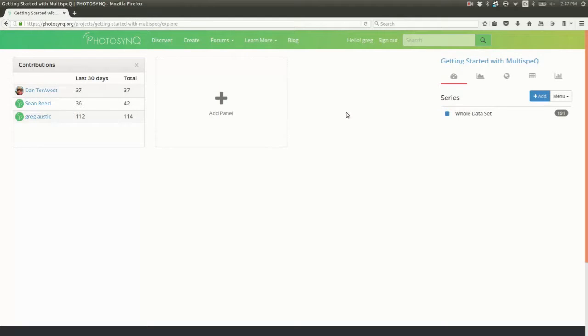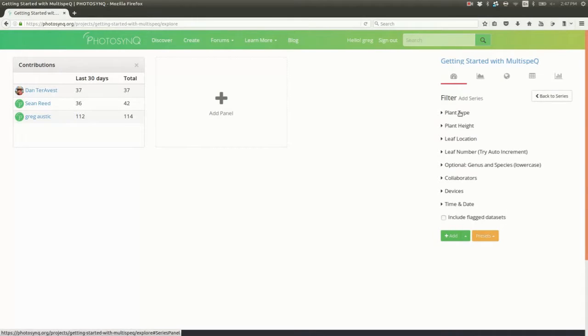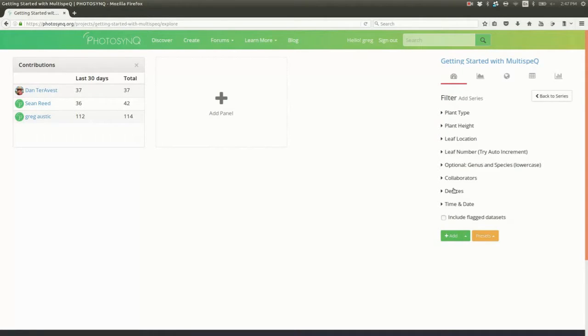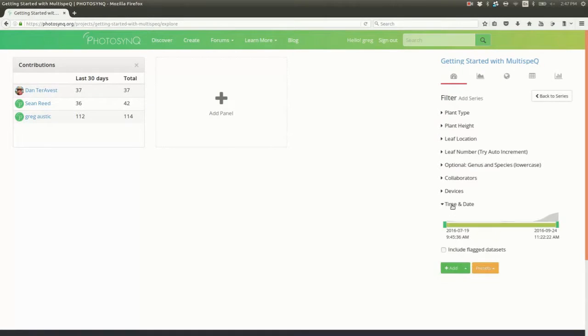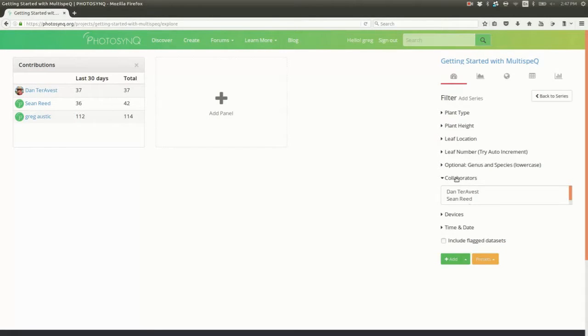First, let's find our data point. We'll start by creating a new series to filter the data. Click Add. You can see all the questions we answered when we collected the data, along with time, devices, and collaborators. Let's find our name and hit Add.